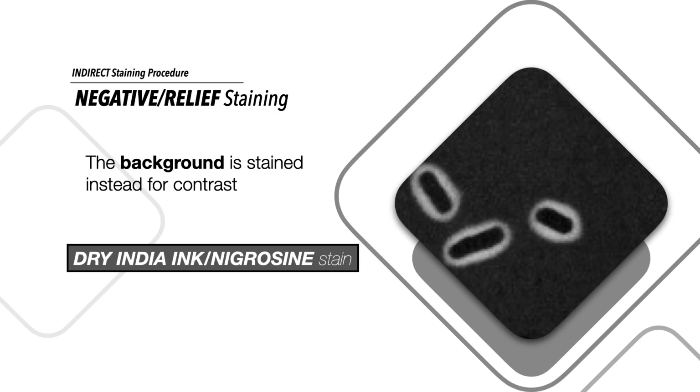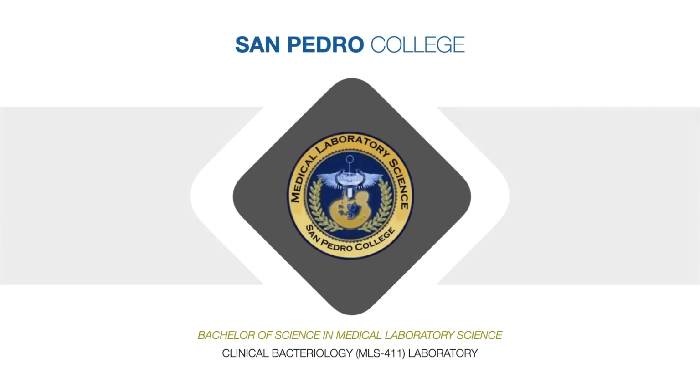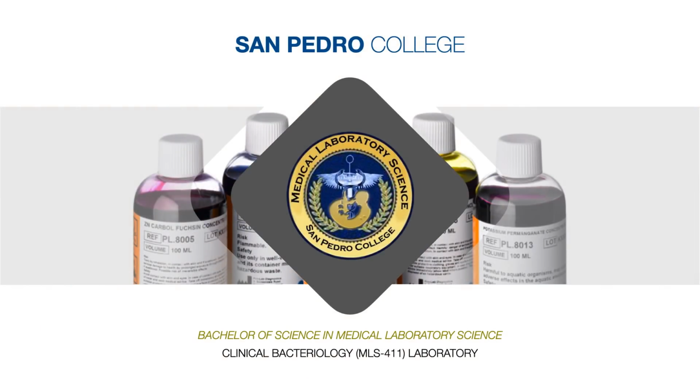Alright. So, that's it for the first part of your staining. We've tackled simple staining, selective and special staining, the different types of staining procedures, your direct and indirect, the nature of the dyes and what staining is really all about. Now, prepare yourselves for the demonstrations that will come after this, and of course, for the last part of the staining next week, and that is your Gram staining and AFB to be given to you by Sir Kuday.